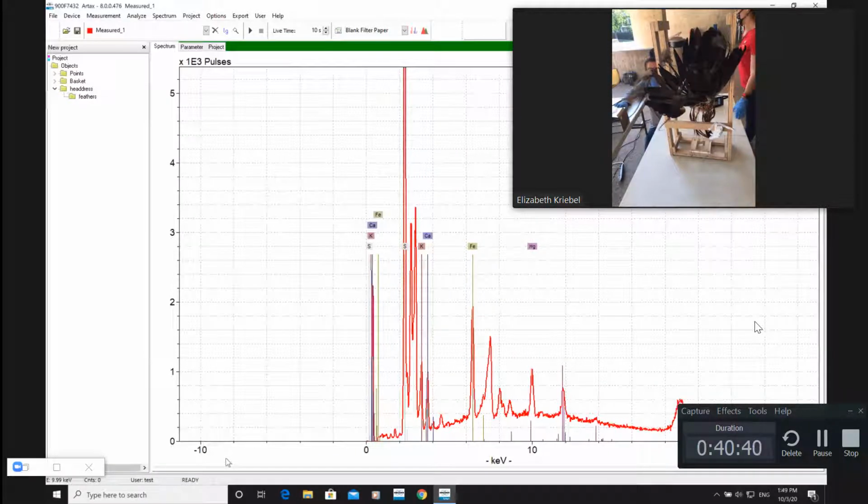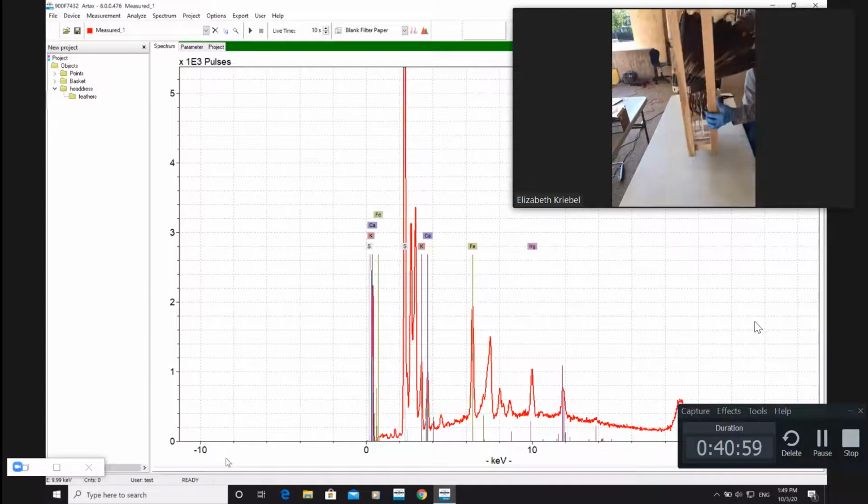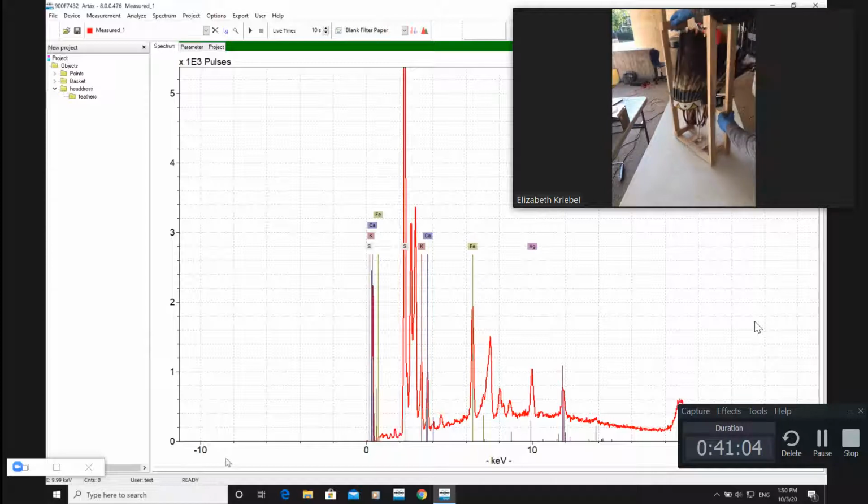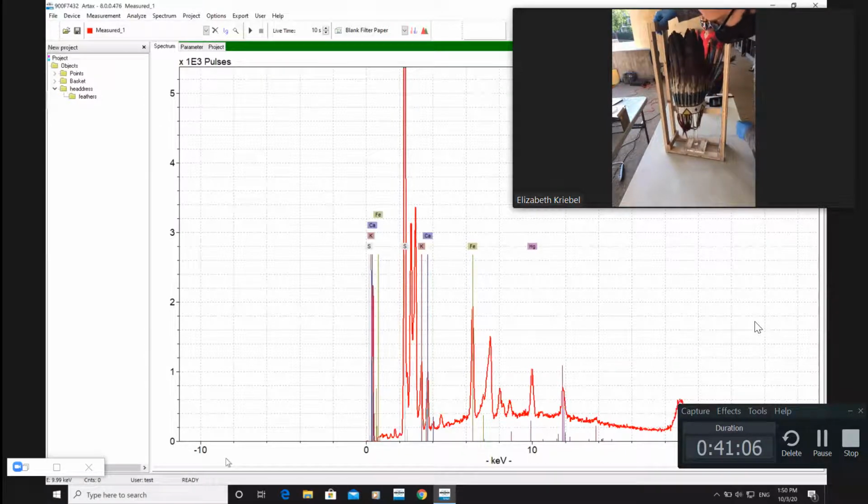What would be your best guess? Well, the mercury is absolutely not a pigment because this is blue. The only pigment I know of, if anyone listening knows of any others... We've got a bunch of mercury on the blue string, and we don't know of any pigments that are blue that use mercury, so we don't think it's pigment. Yeah, it's got to be some sort of mercury treatment on the string specifically that was not on the feathers, right? Yeah.